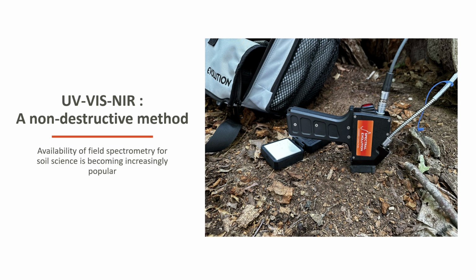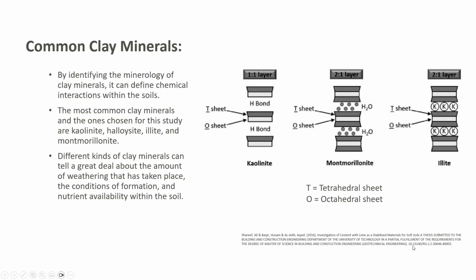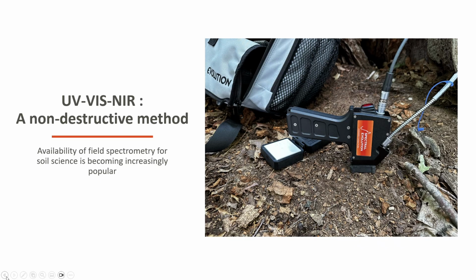So when taking a reflectance measurement in the field, it can be conducted with either a contact probe, or for a larger area sample, with a bare fiber or a lens. That would be a cone reflectance, so how far you are from the ground would dictate how big your area is. With a bare fiber lens, you'll have a much broader sample size.